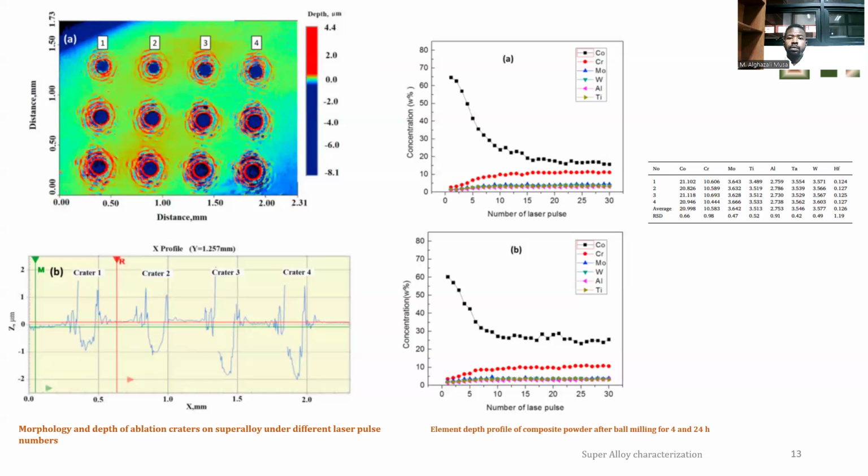So it's a very powerful method. Detection limit is very low, high resolution, and also full characterization. And even some of the methods could not measure some of the elements such as lithium, etc. So this method is able to measure those sensitive elements within the periodic table.